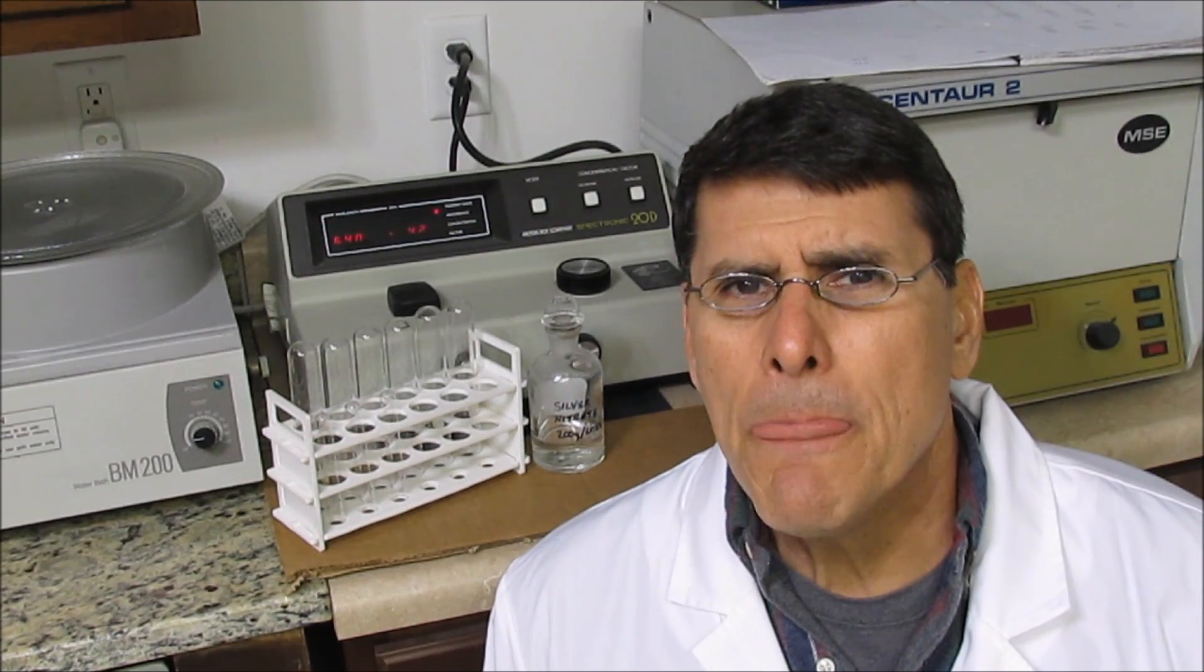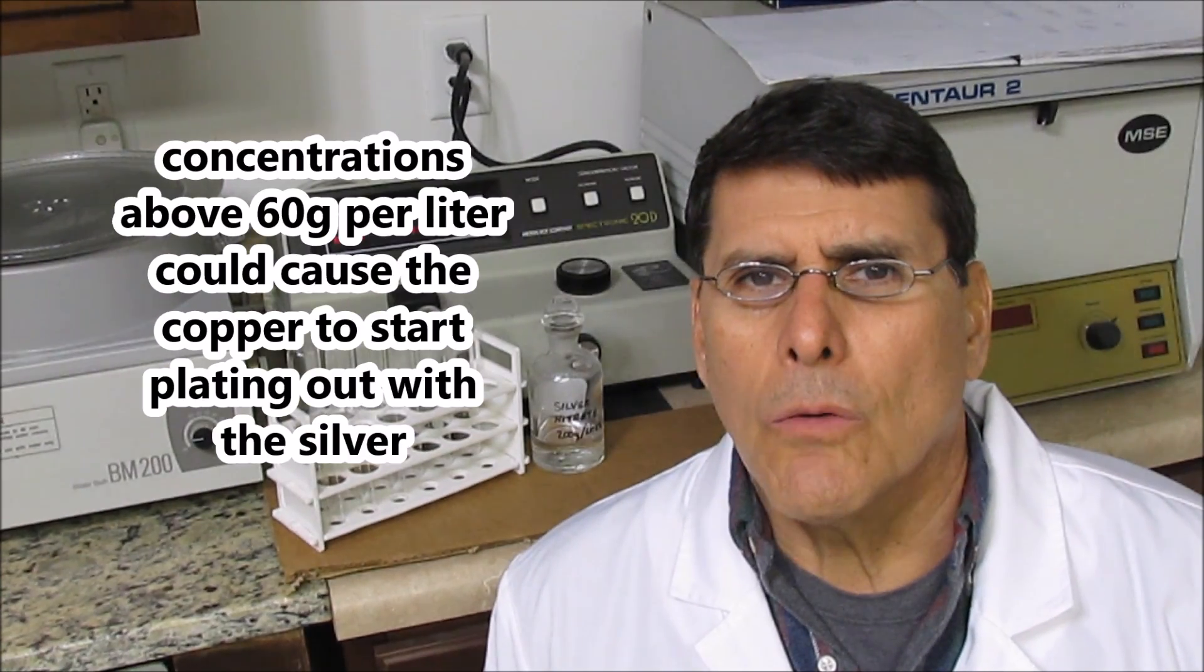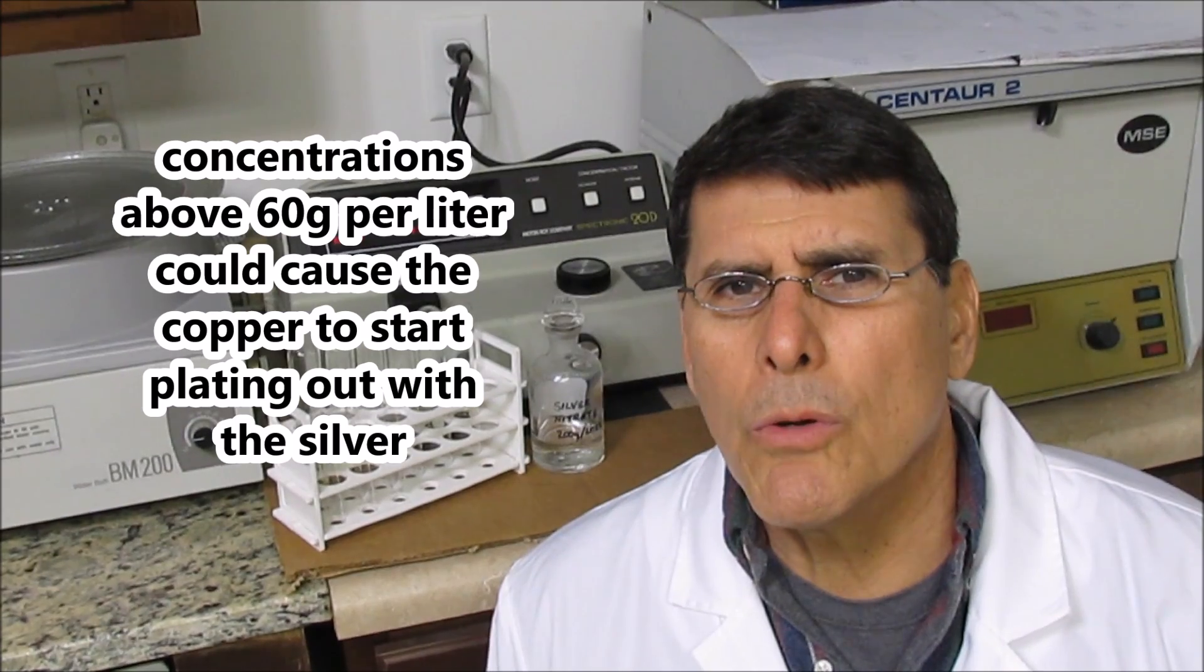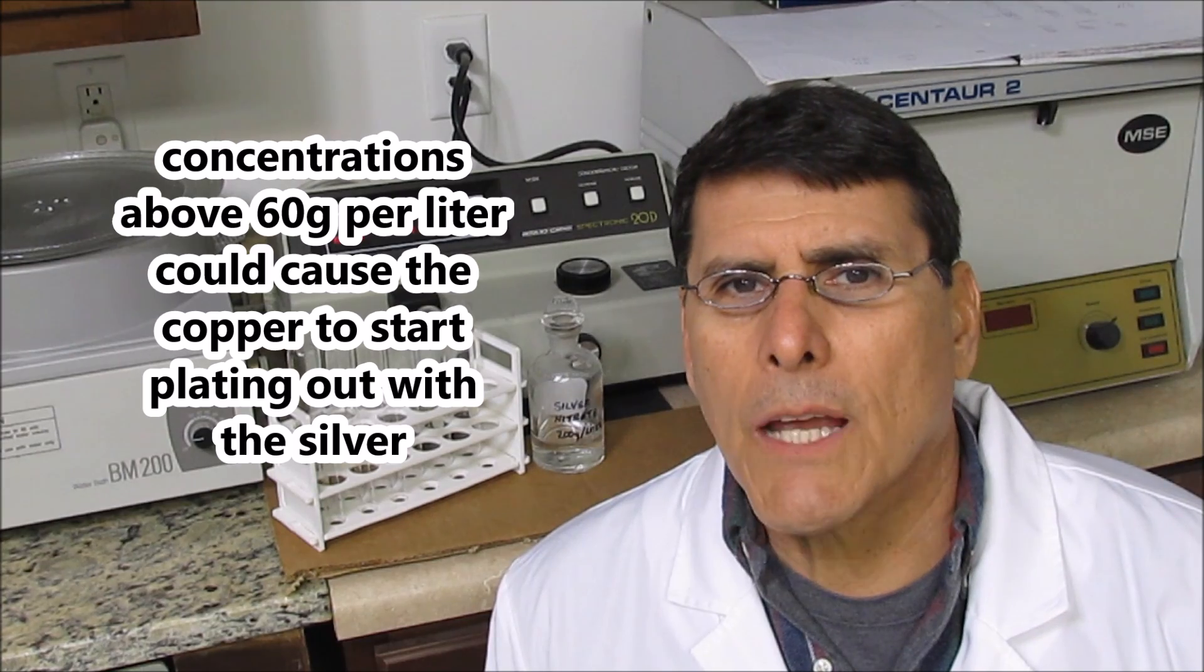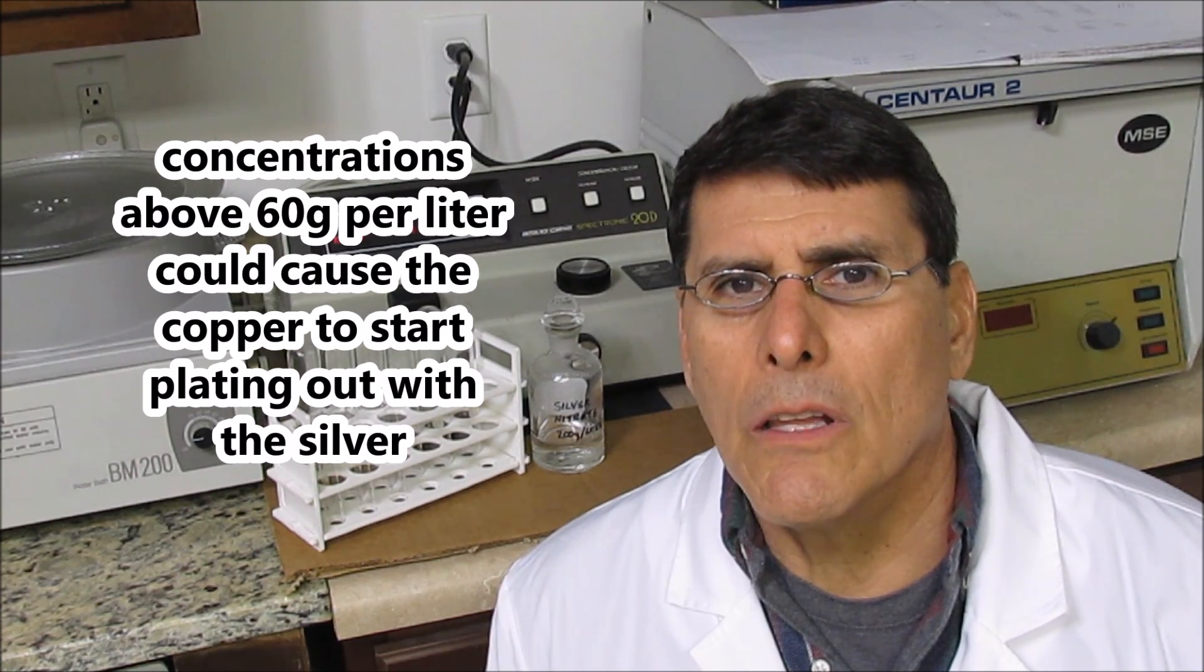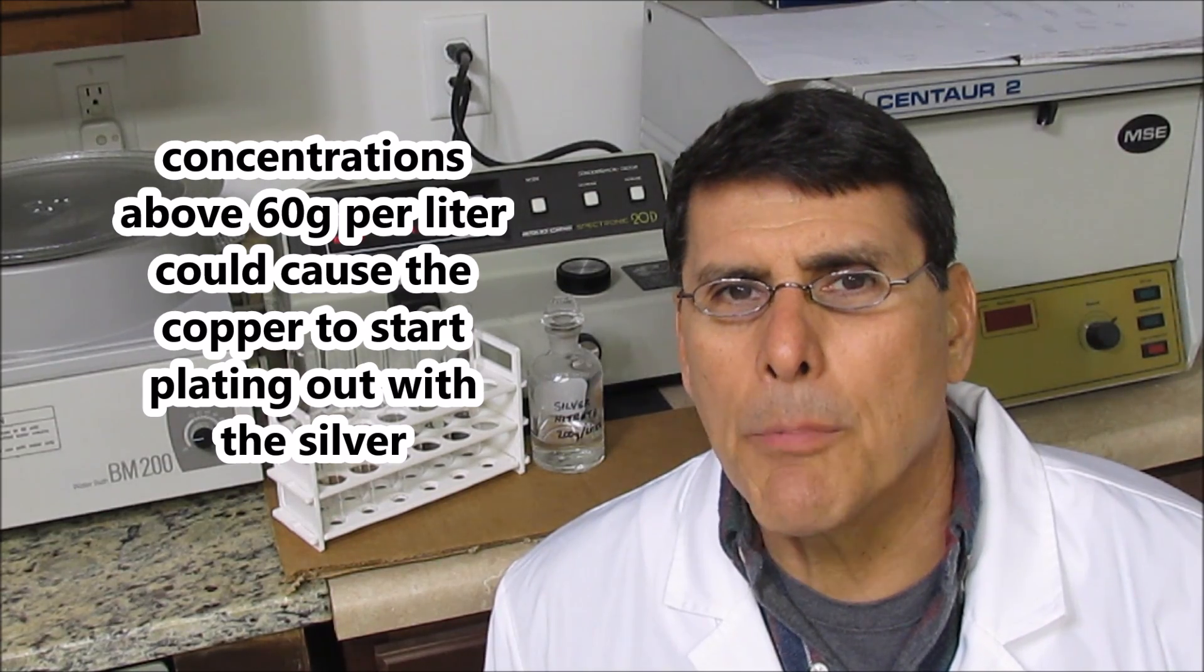Today I'm going to start up my electrolytic silver cell. I want to use the electrolyte from a previous refining, but it looks dark blue like there's a lot of copper in there. 60 grams per liter is the limit that I want to stay under for dissolved copper in my silver cell electrolyte, and I can't tell by looking how much copper is in there.